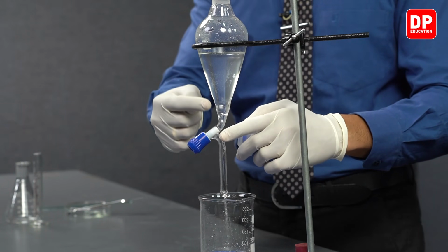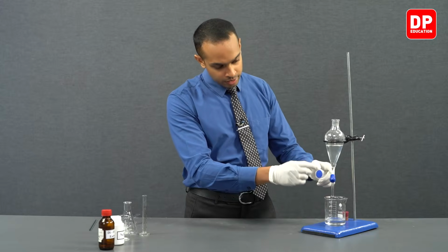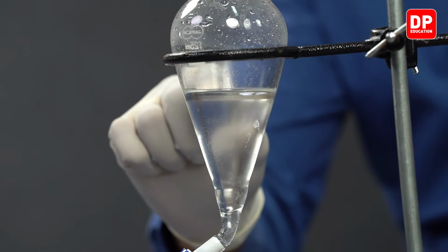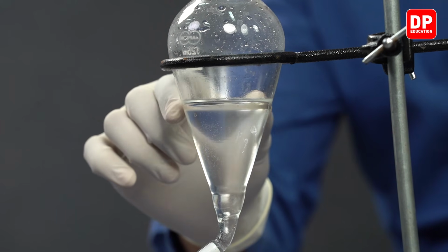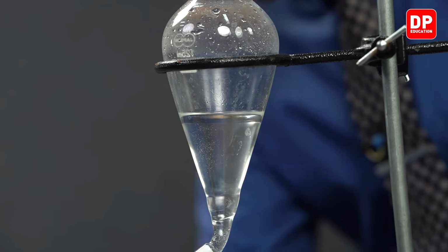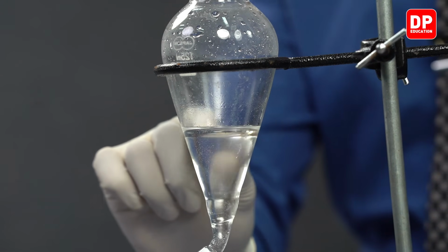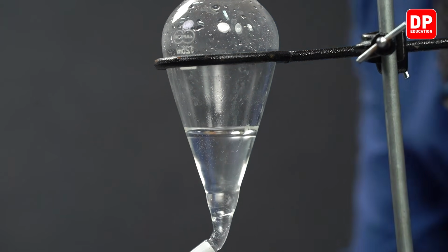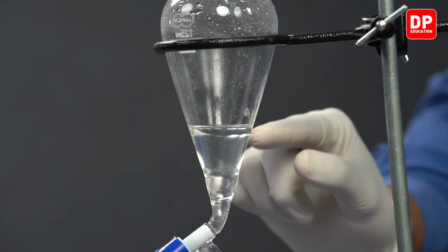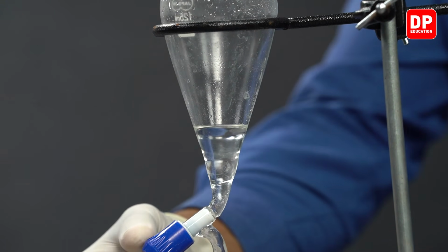Now you can see the aqueous layer is getting collected into this beaker, and as you can see, when the liquid level is going down, we can very clearly see the diethyl ether layer over here. That's a very small diethyl ether layer that can be observed over here. We can now very clearly see the two separate layers. There's a very small layer that we can observe over here. That is going to be our diethyl ether layer.